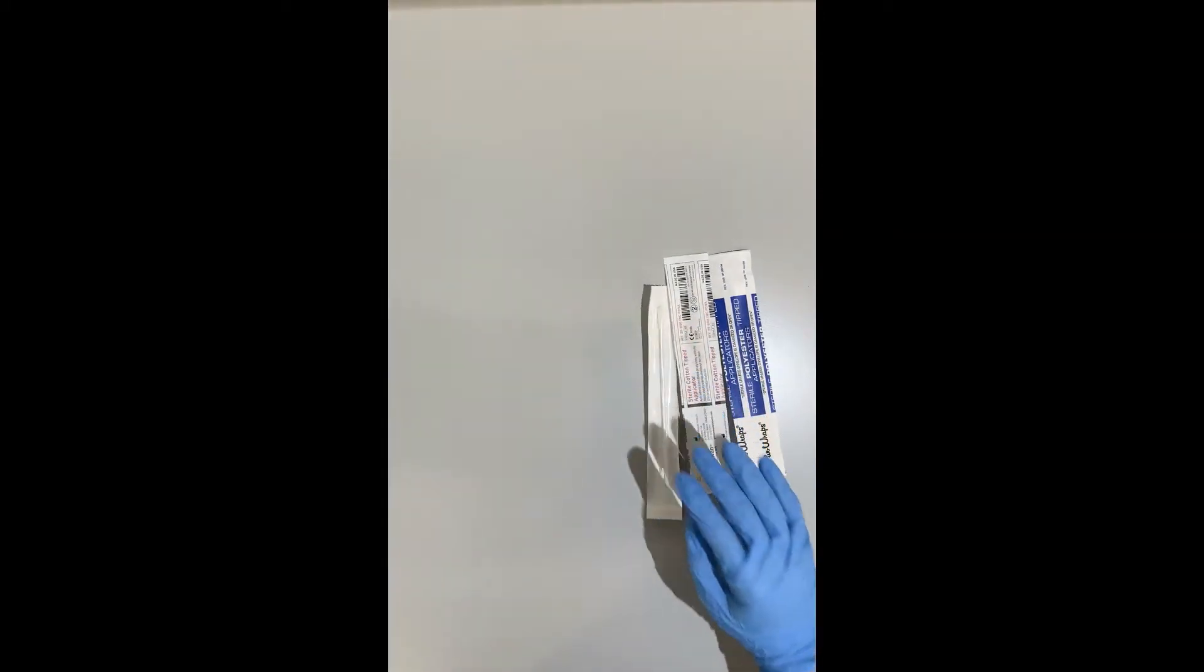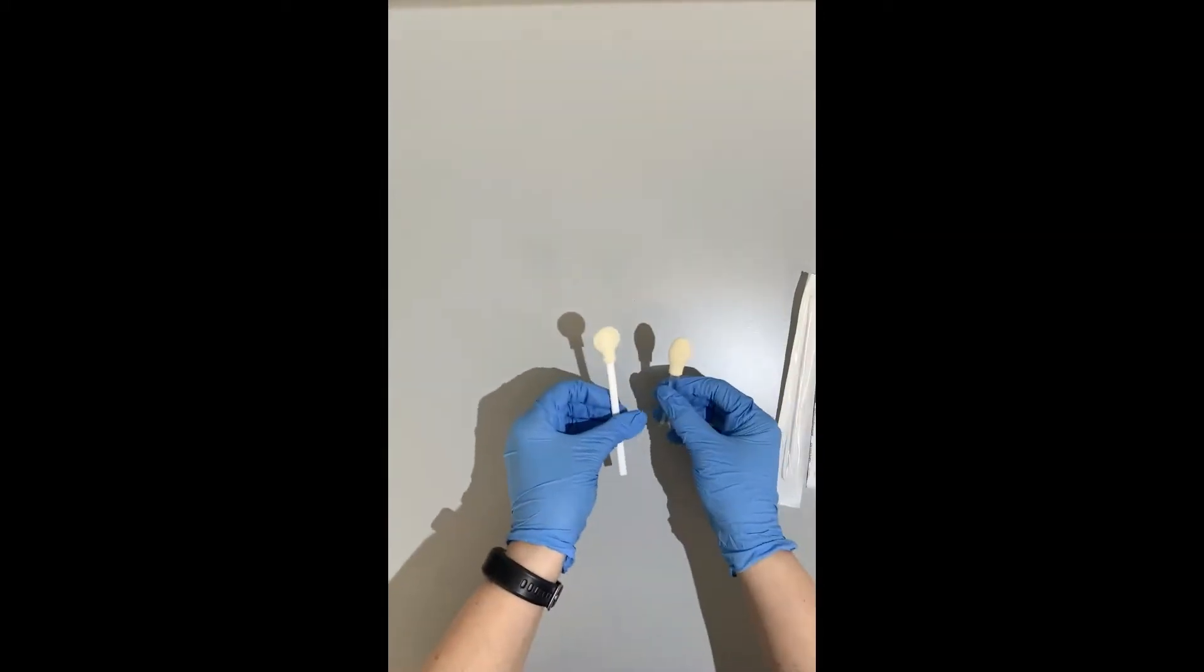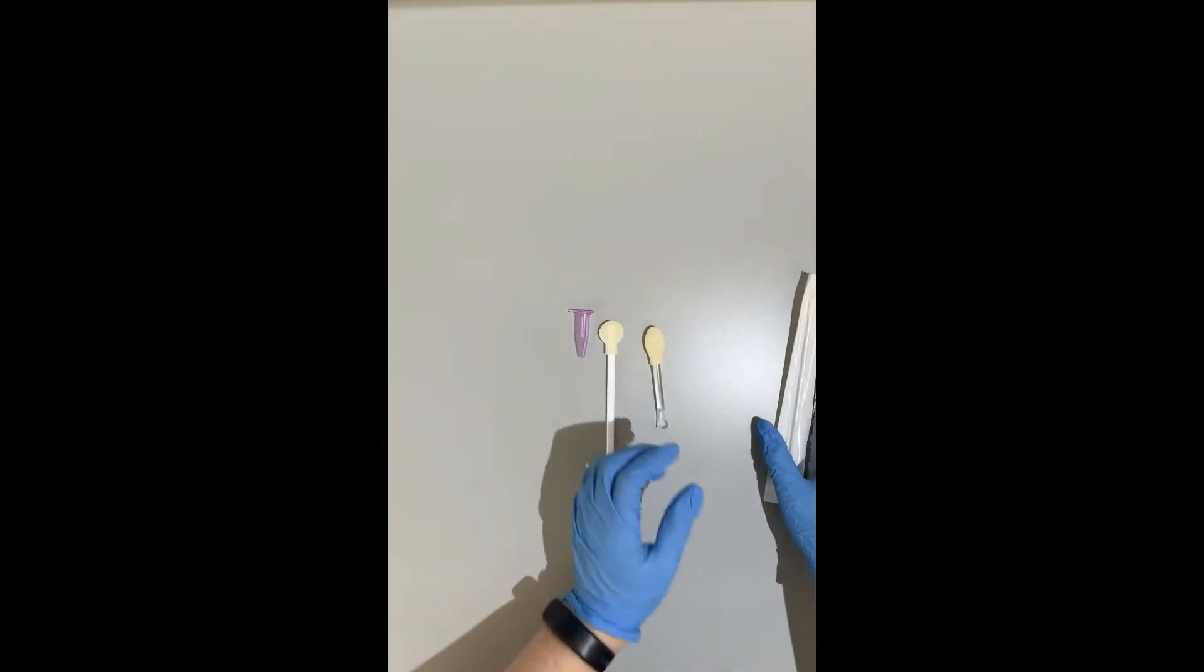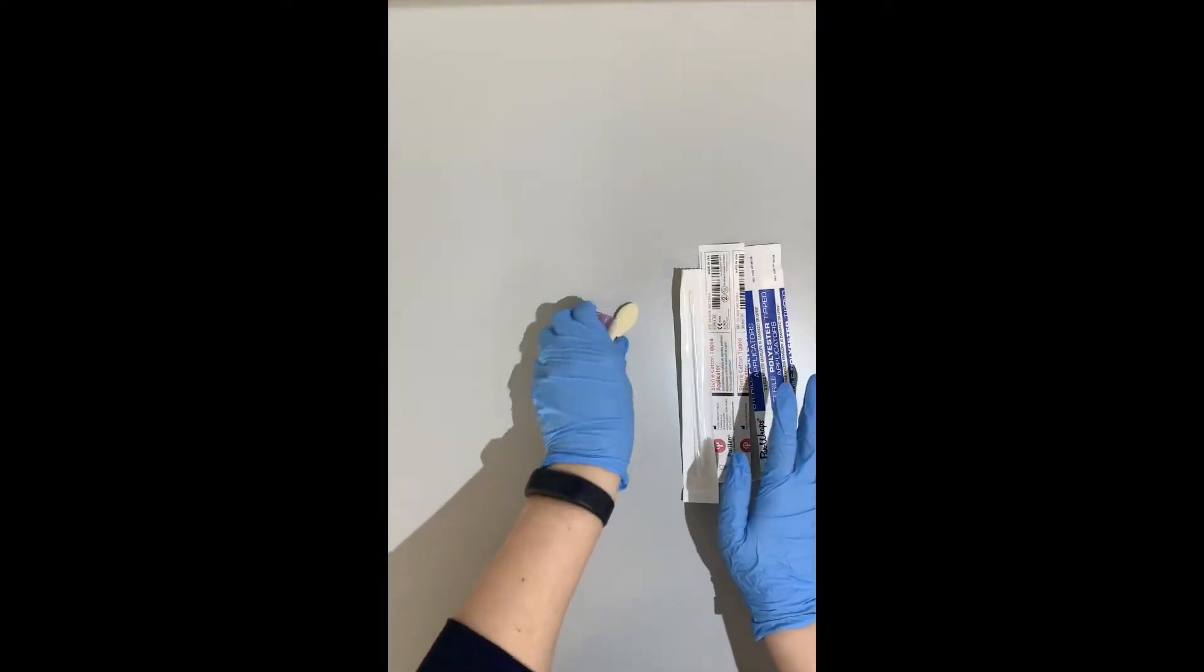We do not suggest using any type of foam swabs with these larger heads on them because the items of evidence that we put in tubes are this size. There's no way to fit this large stick and foam head into a tube this size, so we recommend using the smaller types of swabs.